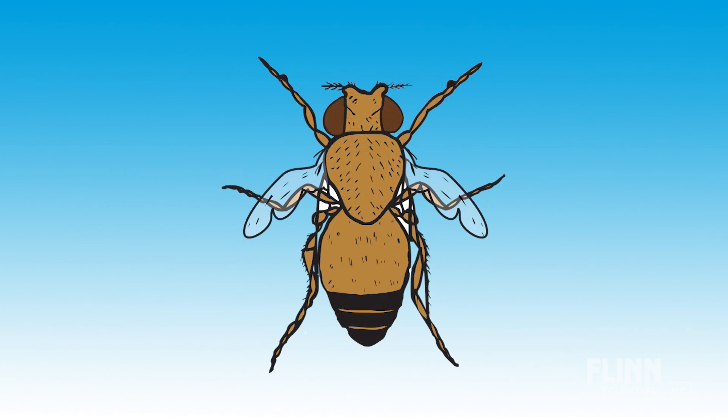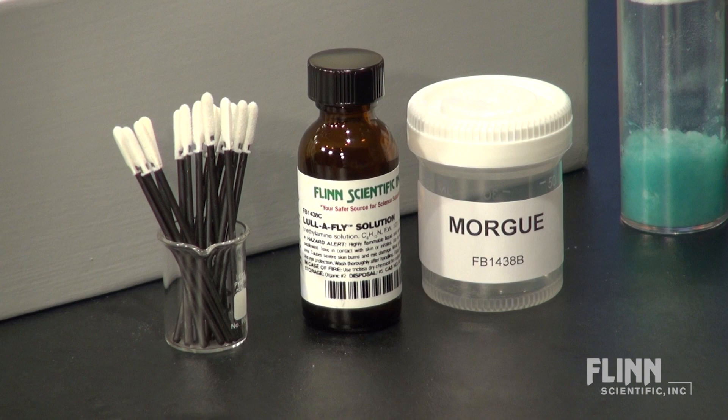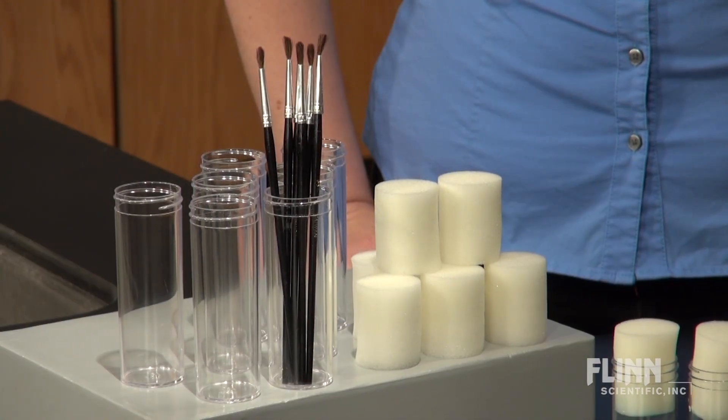We even offer a double mutant that has both vestigial wings and sepia eyes. Besides cultures, we offer all the required accessories such as vials, culture media, anesthetizing solution, and camel hair sorting brushes.